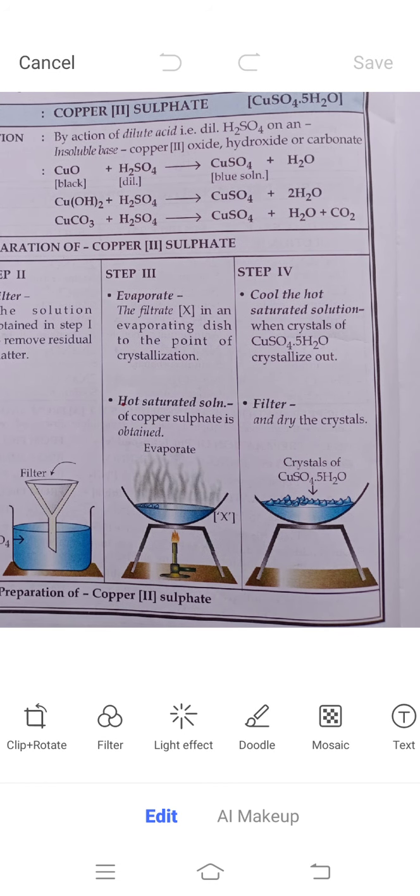In the fourth step, we cool the hot saturated solution till the time the crystals appear. You can do the cooling in an ice bath - take a tray of ice and put that container containing your solution into it. After it crystallizes, we will remove all the crystals and dry it.